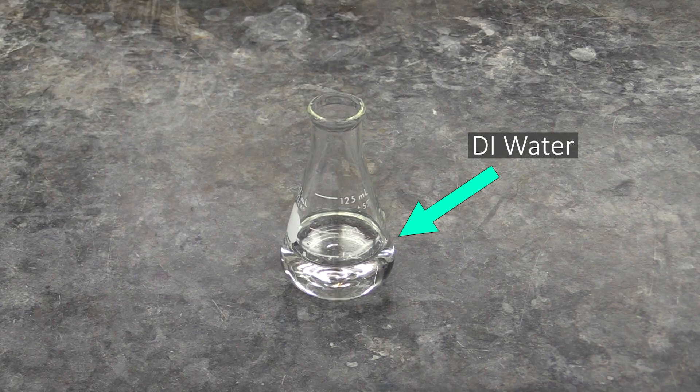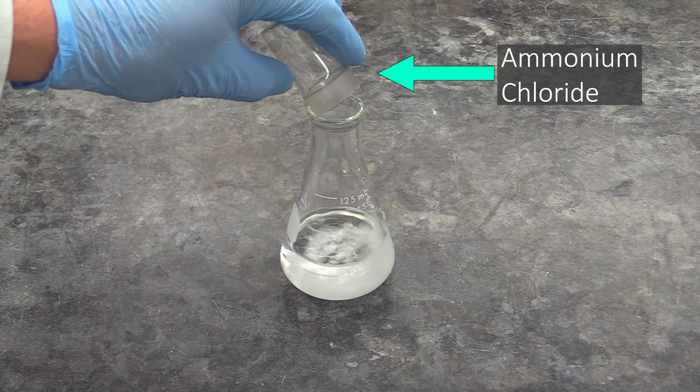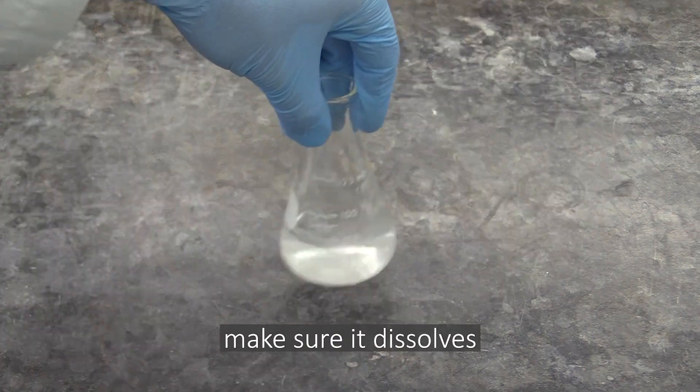For your second reaction, you'll add some DI water to a flask, then add a few grams of ammonium chloride to that same flask, mix, and monitor the reaction's temperature over the following few minutes.